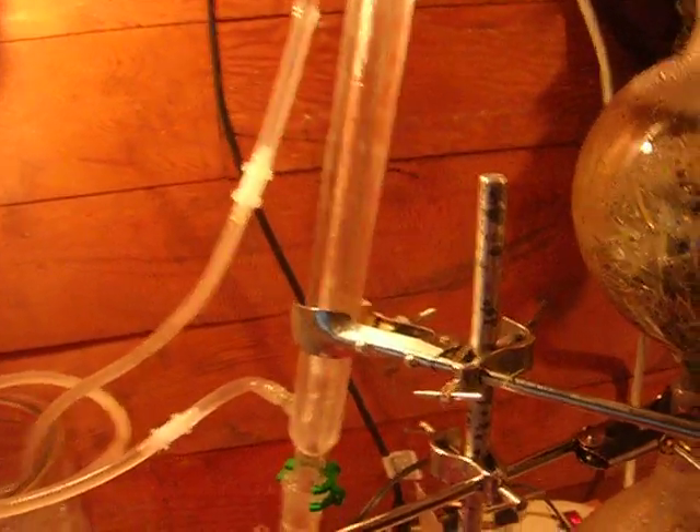Then steam carries the oils up through here. This is the condenser. That long tube is actually a double chamber — there's water on the outside, you can see a little at the top there. The condensate runs down the middle. If you look here, that's where the water flows back out.